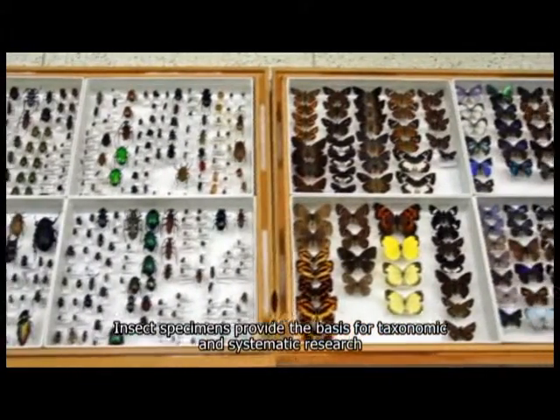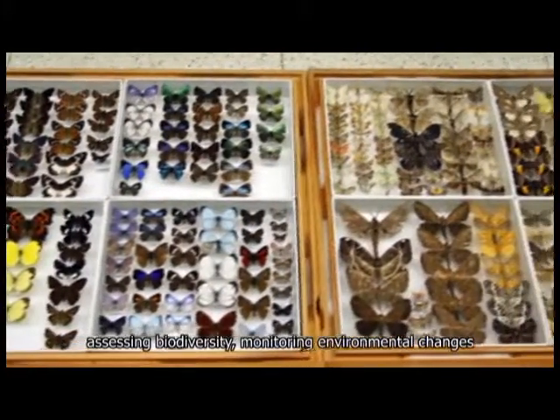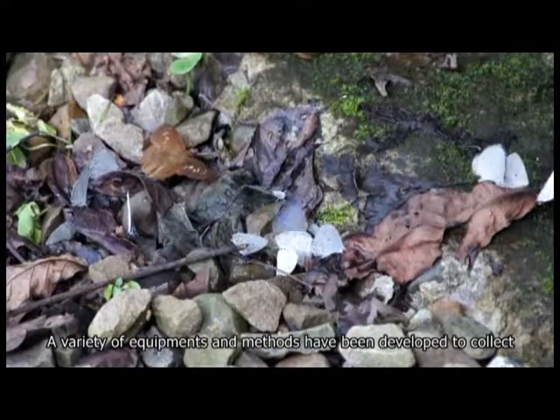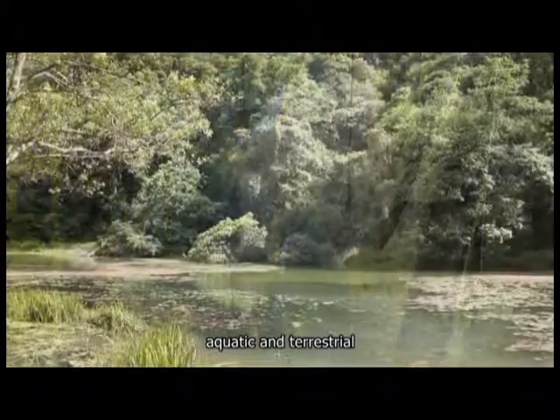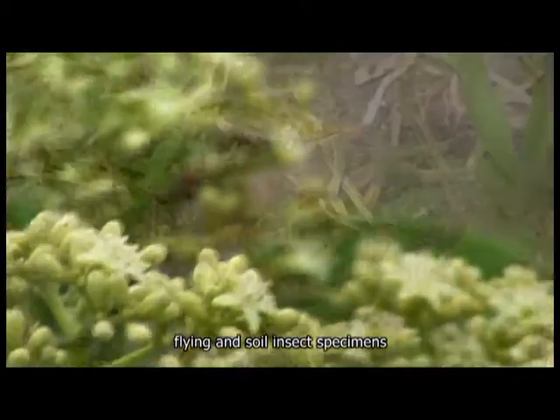Insect specimens provide the basis for taxonomic and systematic research, assessing biodiversity, monitoring environmental changes, and pest control. A variety of equipment and methods have been developed to collect nocturnal and diurnal, aquatic and terrestrial, flying and soil insect specimens.